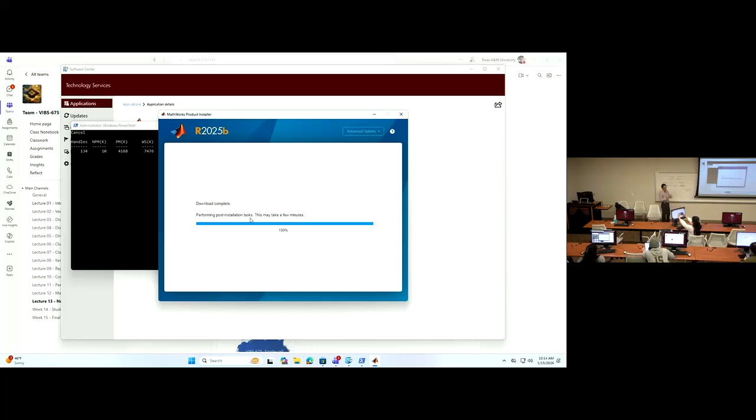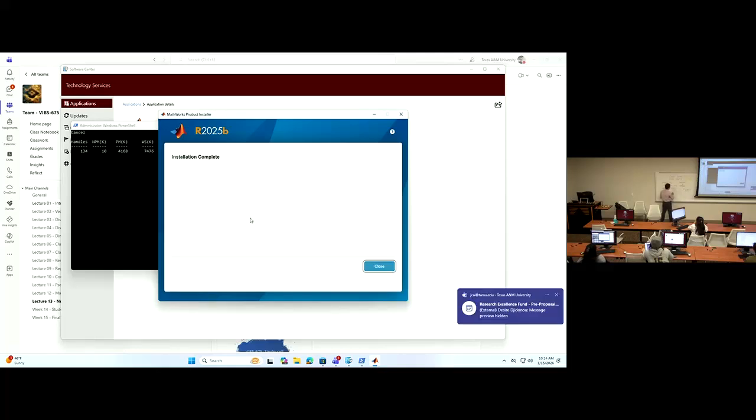So for your own project, you send the sample to a sequencing center, you get FastQ files back. You can just upload them to this cloud to run Cell Ranger, and you will get an expression matrix file. Once we have this, we are going to come back in MATLAB to run SCGEA2. This is an application called single cell gene expression analysis tool. We are going to put this matrix into this tool and start to do the analysis. So that's what we are going to do today.